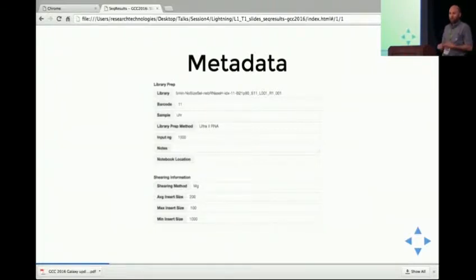I'm talking about experimental conditions like maybe it's concentration of some additive you're working on, maybe it's amount of polymerase, maybe it's a duration of an incubation step, maybe it's how much bead volume you're using, all kinds of metadata that are unstructured. We're also talking about things that we can discover, like flow cell identifiers and barcoded demultiplexing steps, and all the kinds of things that we can pull in that might be related to batch effects that we can then identify and deal with later.